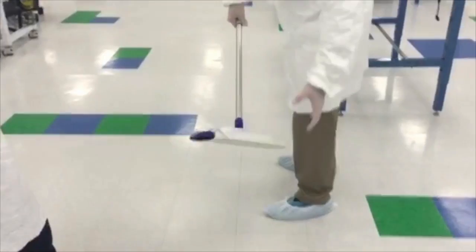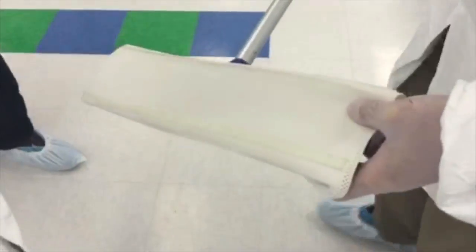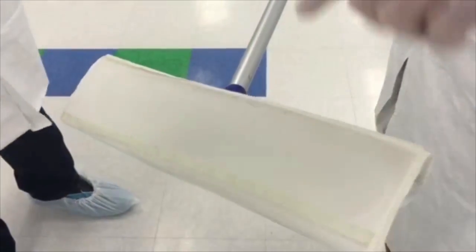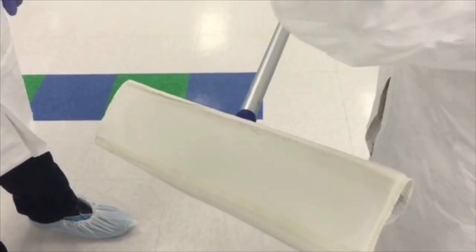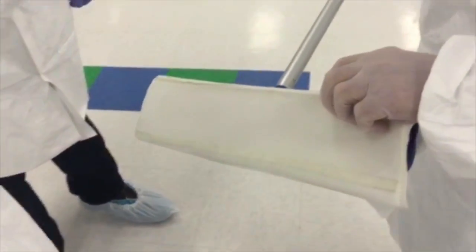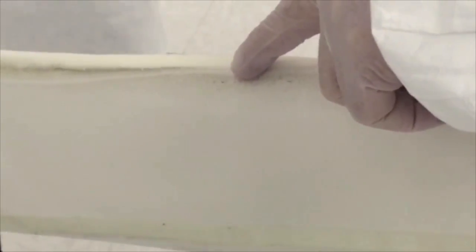For the first time and in a single step, medical device firms can now apply disinfectant cleaners while removing stubbornly adhered contamination such as particles, bioburdens, and large fibers. The Sahara Plus Foramop enables medical device firms to upgrade their cleaning procedures and avoid the unnecessary contamination risks presented by fibers being tacked down to clean room floors by disinfectant residues.